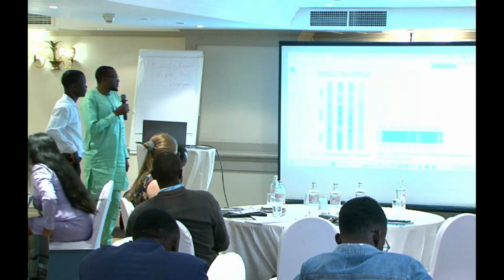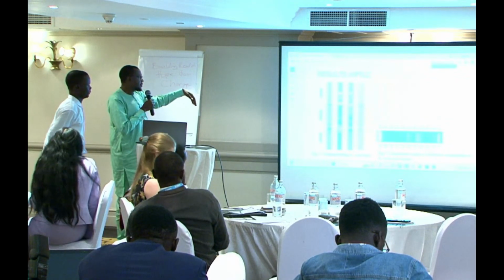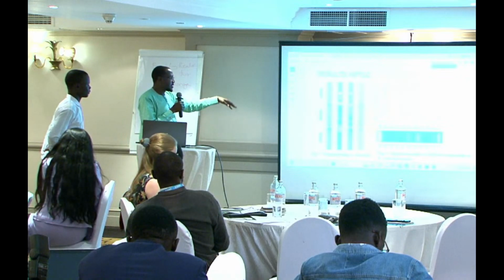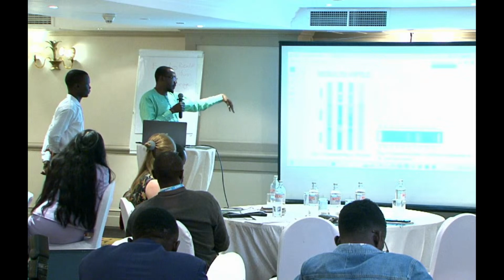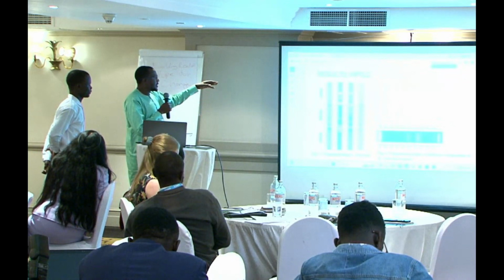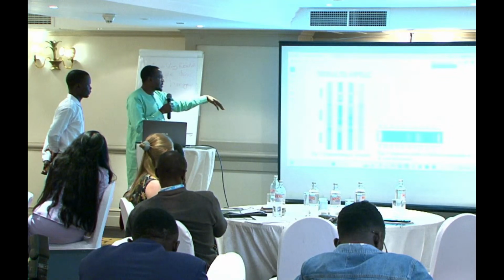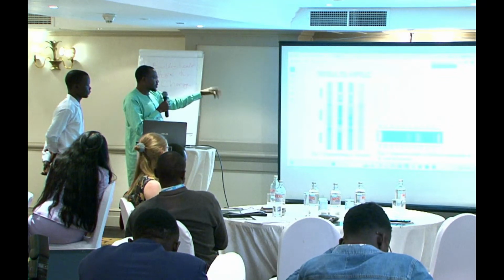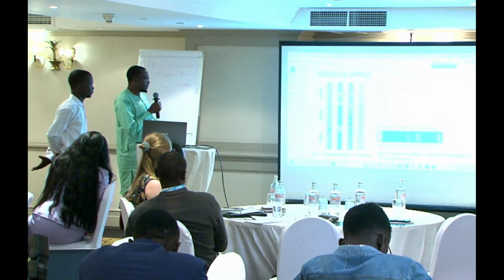Thank you. So these are the results of our HPTLC analysis, and you can see the different zones and the markers showing the fingerprints of the compounds in the system, at 254 nm in the low polarity and medium polarity, and also white light, and at 366 nm in the low, medium, and high polarity.